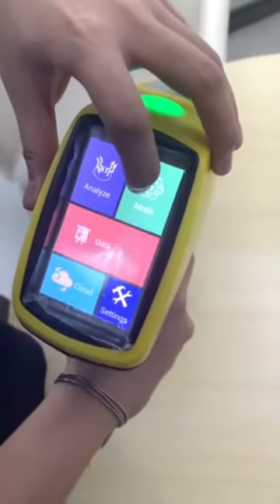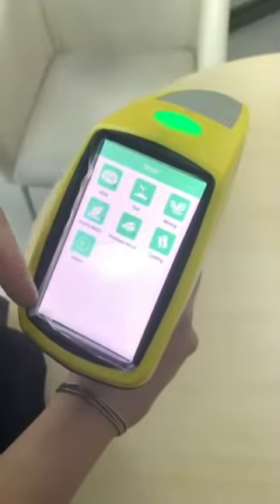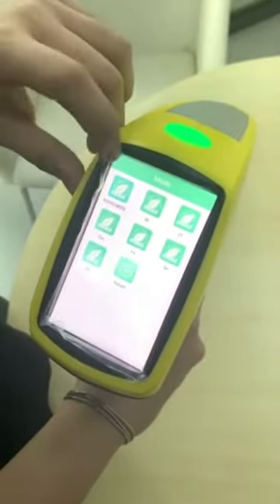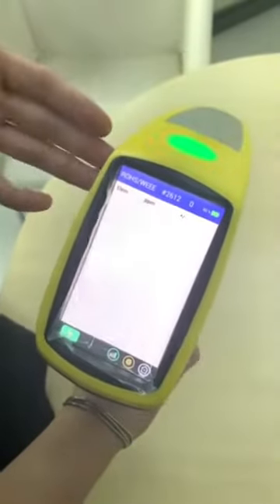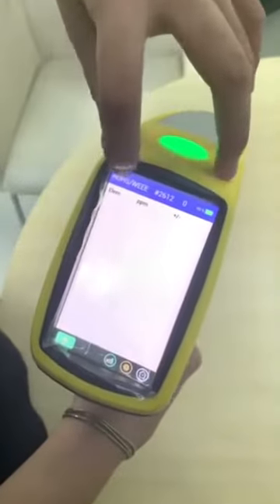Now we choose the mode button — we can choose the mode we want in here. We choose RoHS, and now it will turn to the test interface.